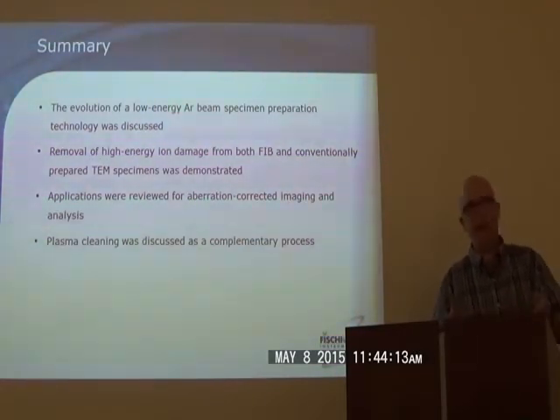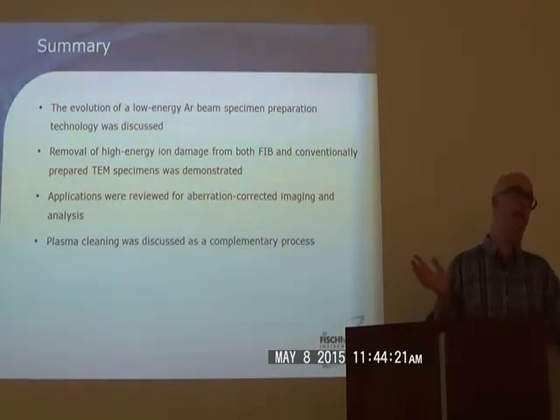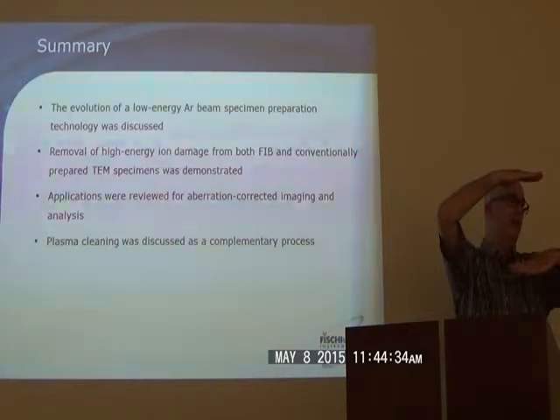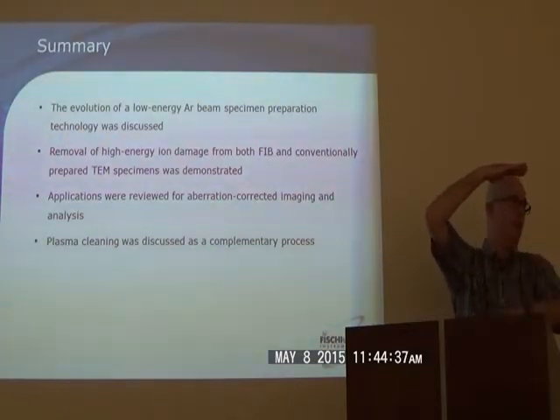It's a pretty good image, but it's only up to a few thousand times magnification. With the Pico, we have a dedicated ion source, which we can't image with, but then we have a dedicated higher resolution electron column with an electron source. And so we can have the electrons incident on the sample, have a STEM detector underneath, and you can calibrate so that you know how thin the sample is.